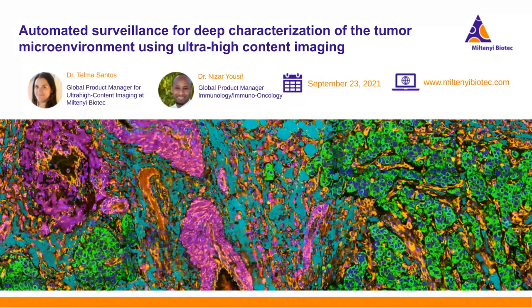We have outputs as regular CSV files, and you can also have the raw data output as FCS files that can be read in most of the flow softwares. So this is the numerical data that comes out of QI-tissue, but out of the MACSima, we also generate regular OME-TIFF files. So any image analysis software will, in principle, be able to read this kind of data as well.